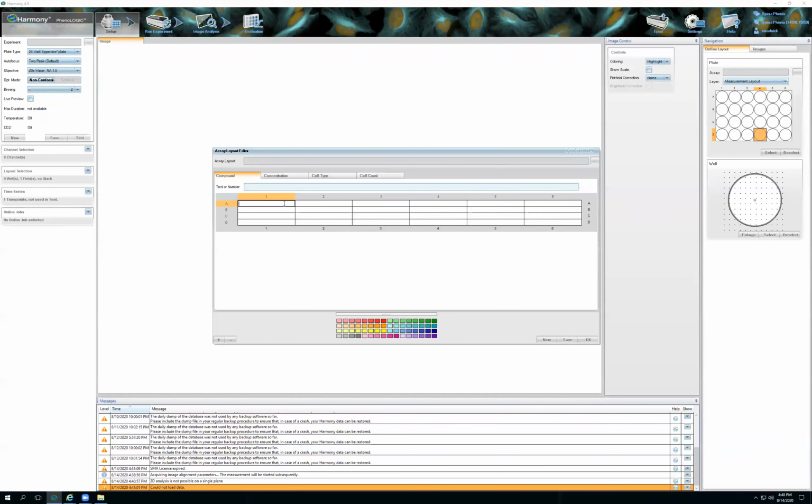And I'm going to create a plate map. This is for my specific experiment, but you want to create a plate map because this will go through with all of your analysis, and whatever you label here will stay with the experiment. Now you can go back and add this at the end, but ideally you remember to add it at the beginning and try to just keep everything organized. So let me just finish doing this.